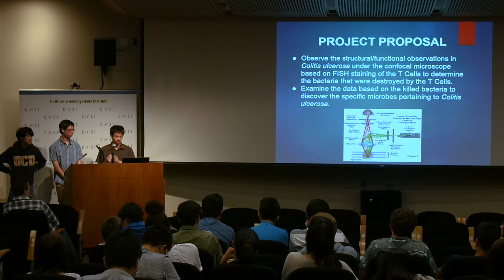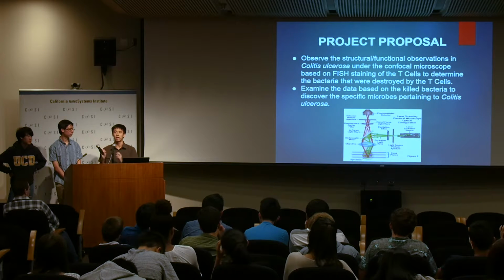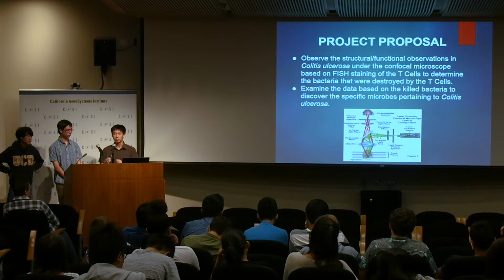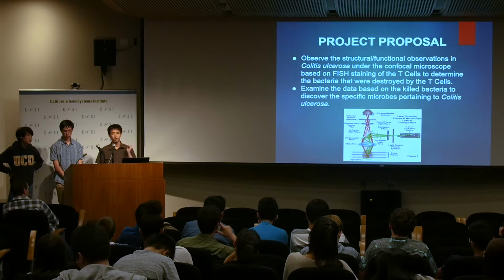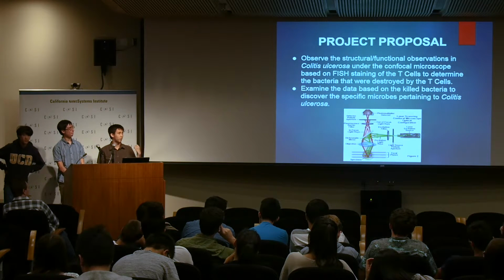With this, they insert fluorophore labels that allow the colors of different cells to be recognized. So groups of cells and different organelles within can be recognized based on the colors given to them, and this allows the localization of different bacteria and cells to be recognized.